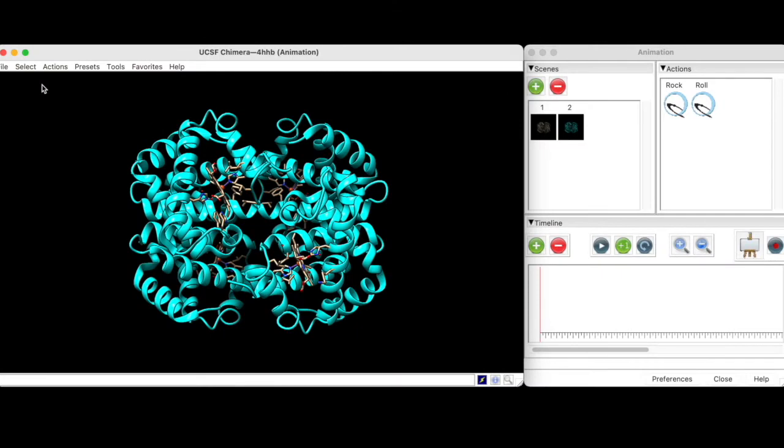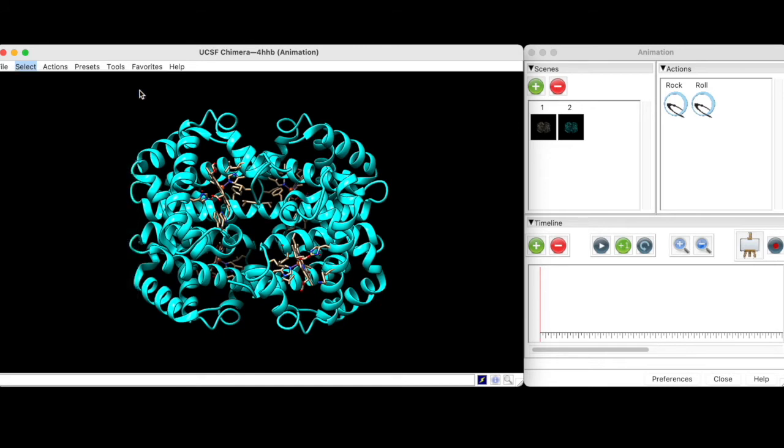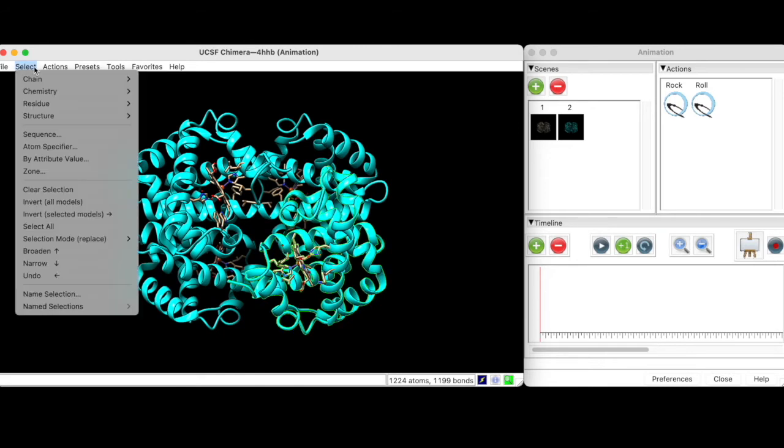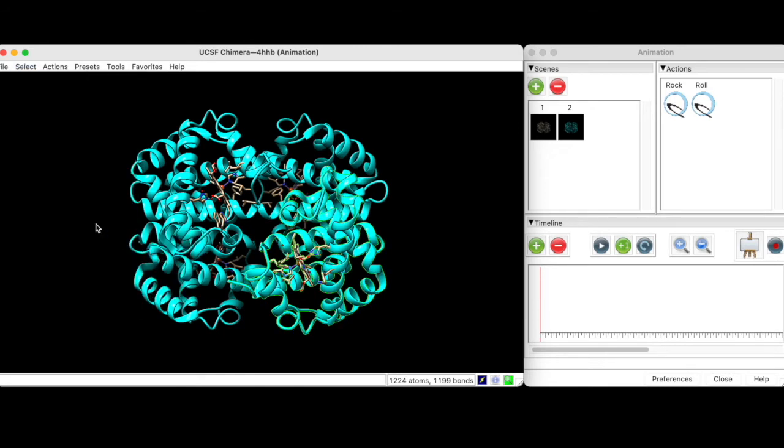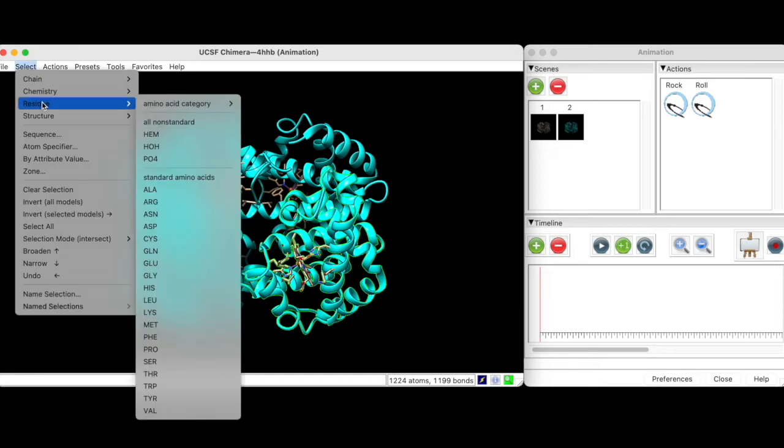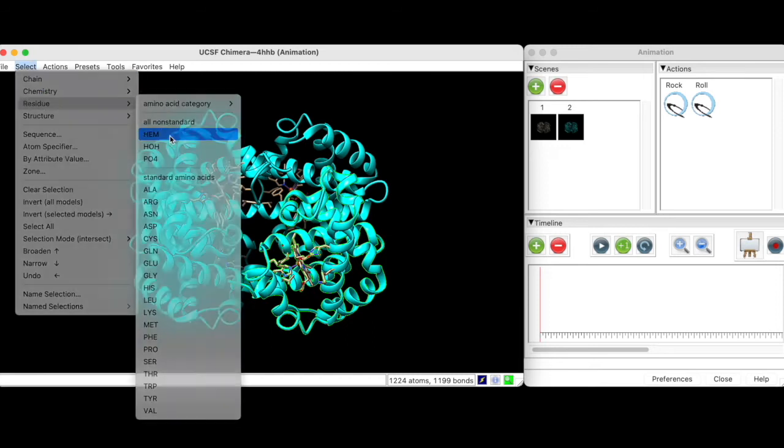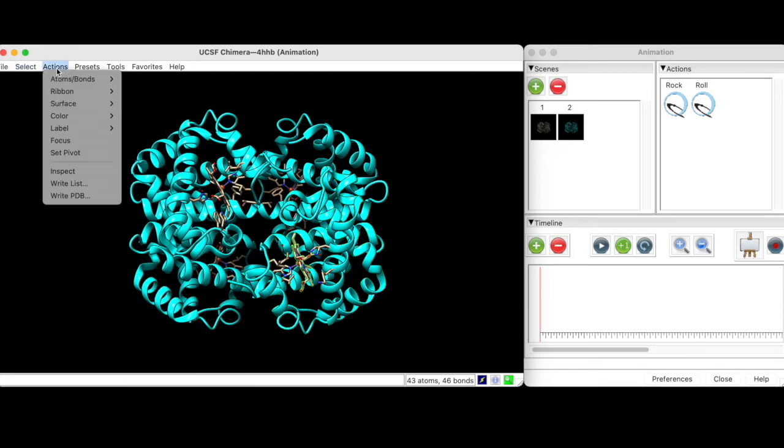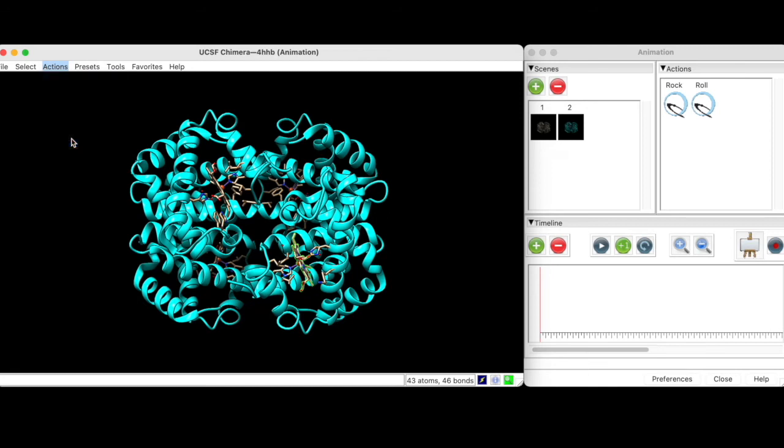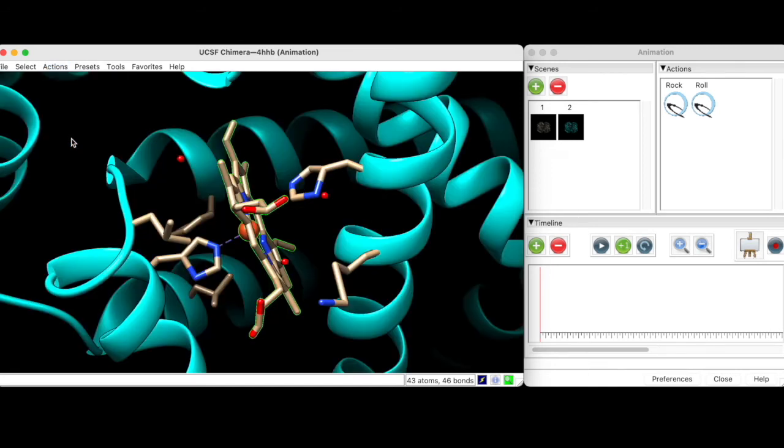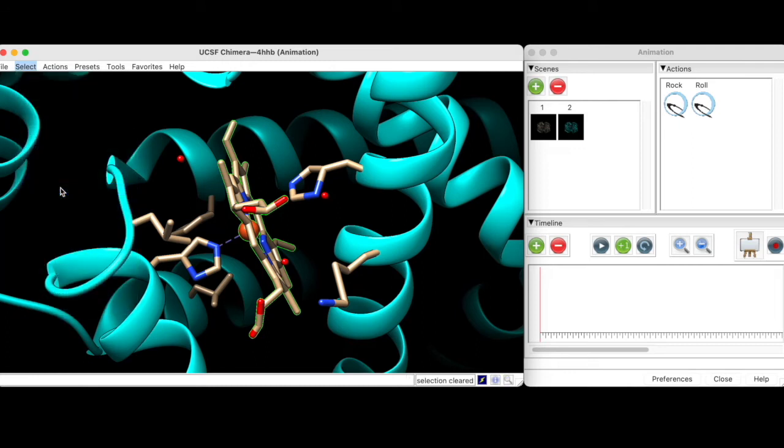For our final scene, we are going to zoom into a heme group by first selecting Chain B, then changing the selection mode to Intersect, and finally selecting Heme. Then, under Actions, we can focus in on the heme group, clear the selection, and take another snapshot to create the final keyframe.